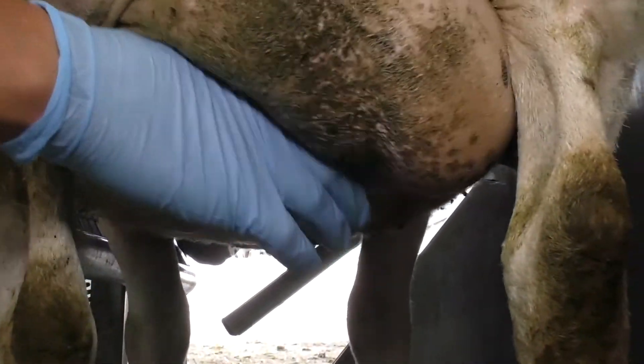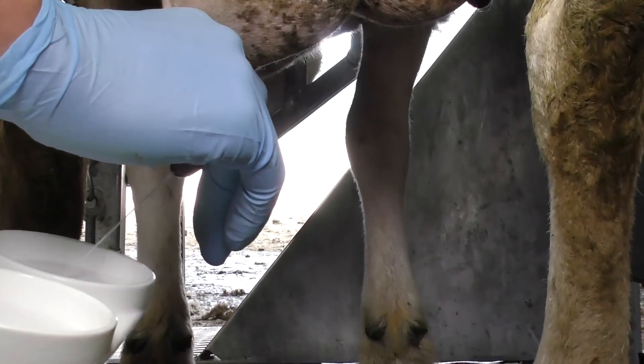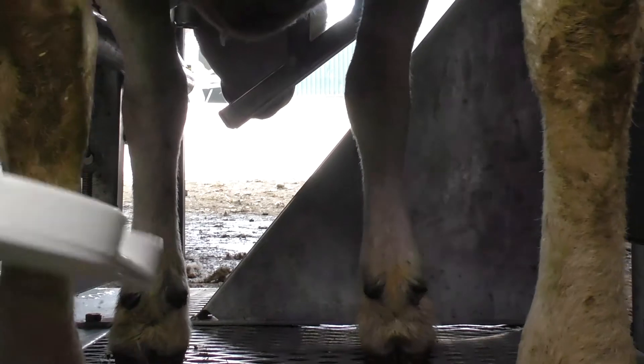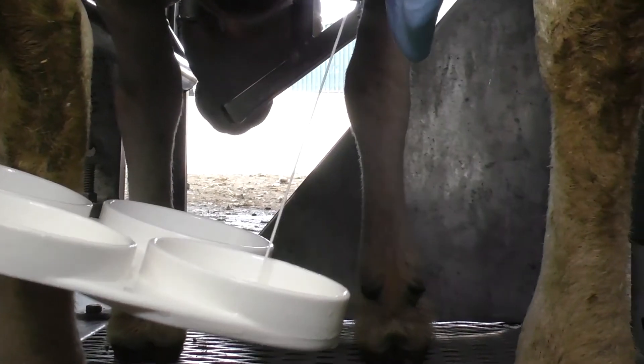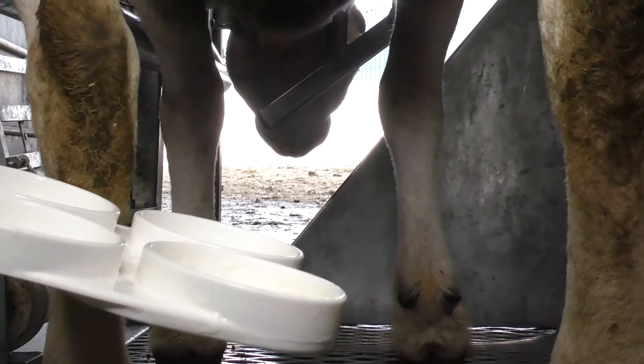So we're just going to milk the udder on the left-hand side into the corresponding left-hand side well of the tray, putting a good amount in each, like that.